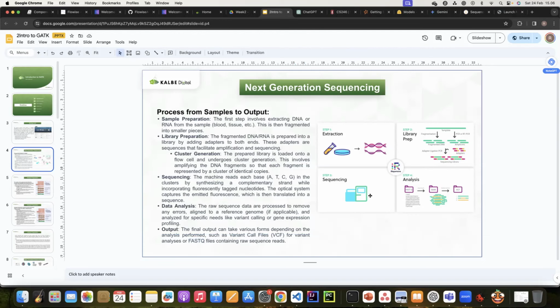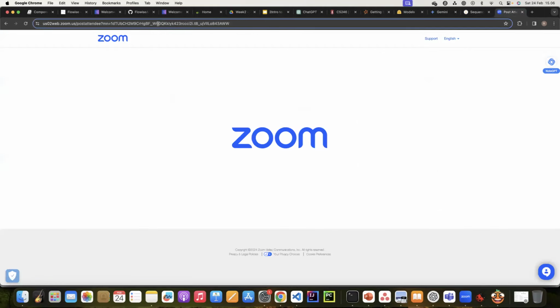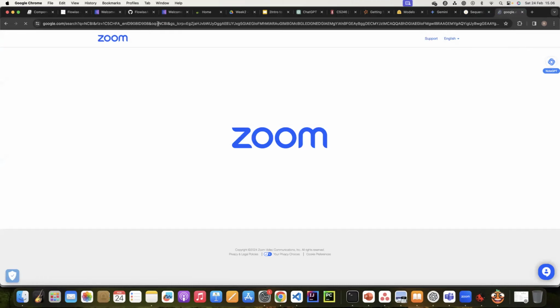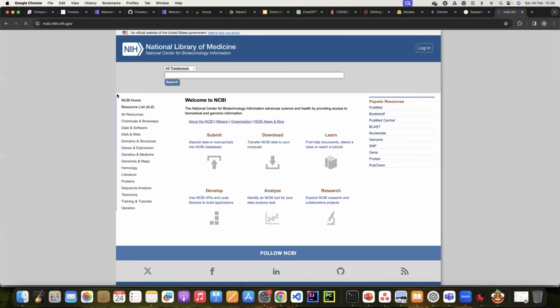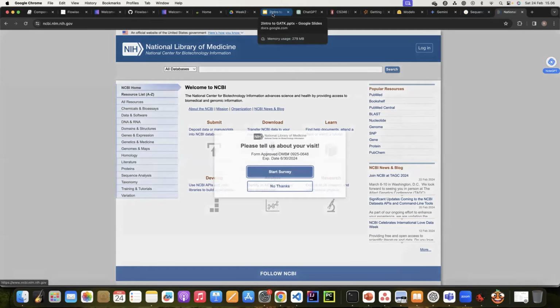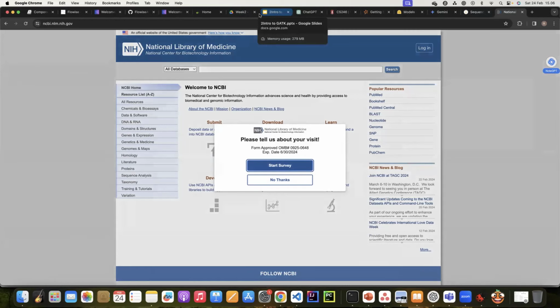Okay, so for gene databases, you can find many in many gene bank databases like NCBI. If you read books, you can see NCBI is a major provider for the data. So many data here. So you have to learn how to get the data and how to compute using a computation platform like TerraBio that we will introduce today.